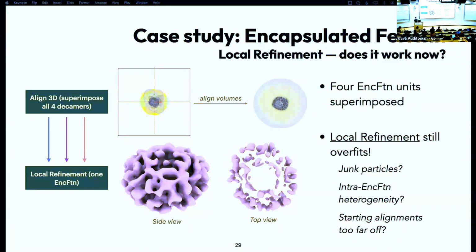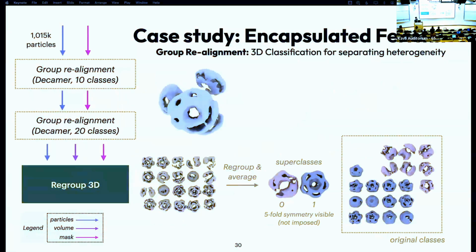And as Rich said, curation is pretty important, and curation in 2D is often not enough to cut it for difficult data sets. So curation in 3D seemed like the best way forward. And so what I did was I launched a 3D classification job on the full set of 1 million particles. Taking these manually expanded particles and running a 3D classification, now we're finally beginning to get somewhere.